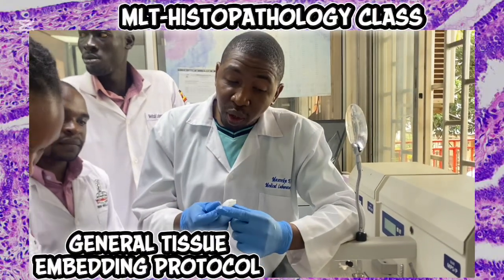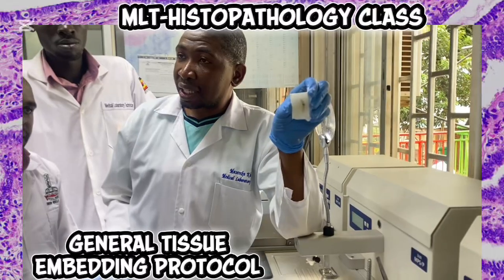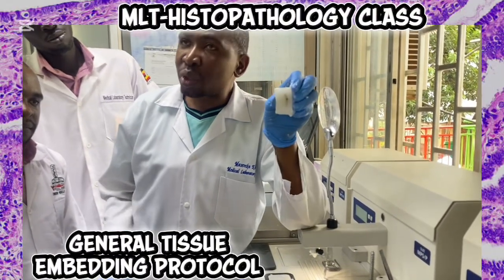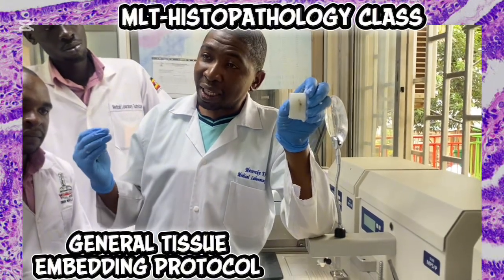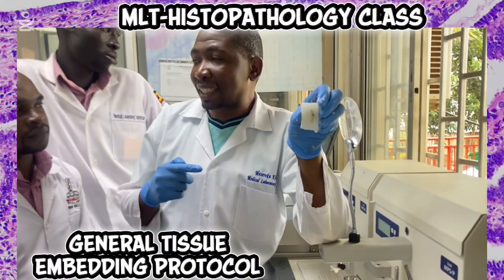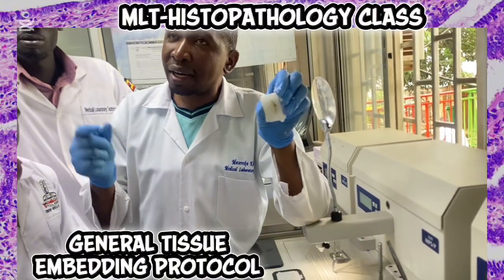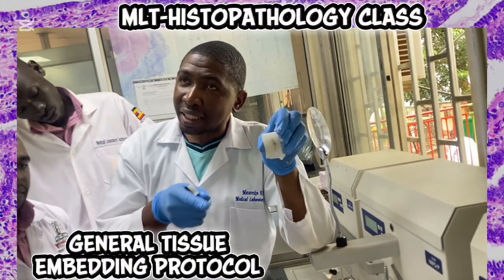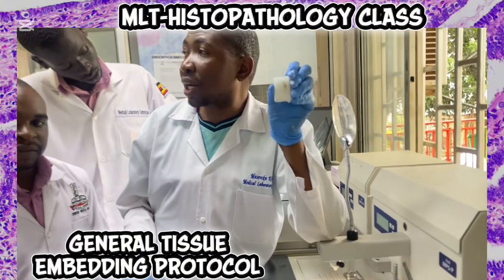So this tissue block, we can keep it for a very long period of time at room temperature. Even when there are any other tests that can be done, we don't need the other sample again, because literally they are stored for some time, then discarded. So you're not going to look for where they discarded these samples. Just get the patient's number, we retrieve, again cut, okay? Stain, give the result, depending on the test you want to carry out.